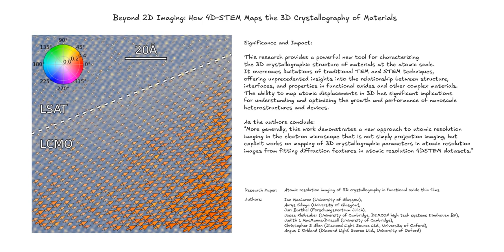Another limitation is the time and computational resources required for data analysis. 4D-STEM datasets can be very large, and processing them can be computationally intensive, highlighting the need for developing more efficient algorithms and software for data analysis.